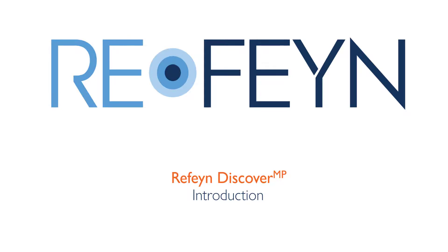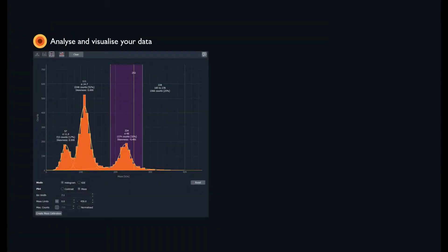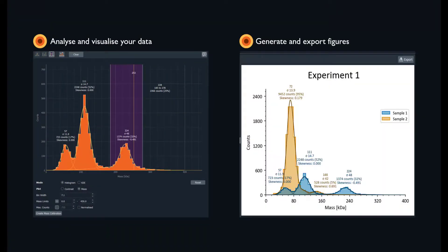When opening the application, you will have access to a workspace that enables data analysis, visualization, and generation of figures for export.